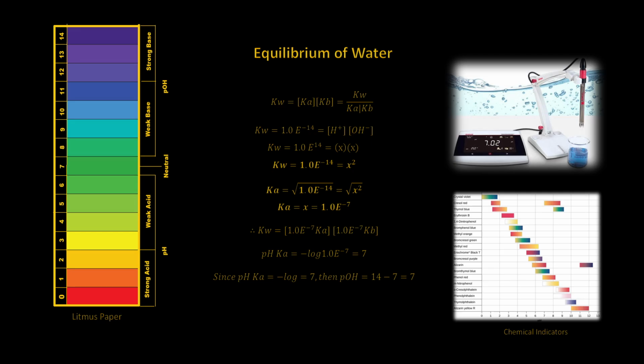It is also the neutral point of a titration, the point where an acid or a base is neutralized. It must be noted that the endpoint may not have an equal molar concentration of each species in a solution, as will be shown in an upcoming slide in this presentation.